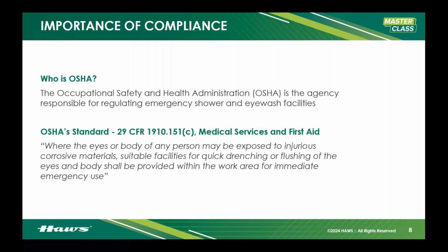The other half of the world references the European standard, which is another document that is really well written, really well done. But it and the Z358.1 standard are incredibly similar. Very, very similar. Now, what's driving this, though, and what we're really trying to meet compliance on, is the OSHA standard. That's 29 CFR 1910.151(c) under medical services and first aid.